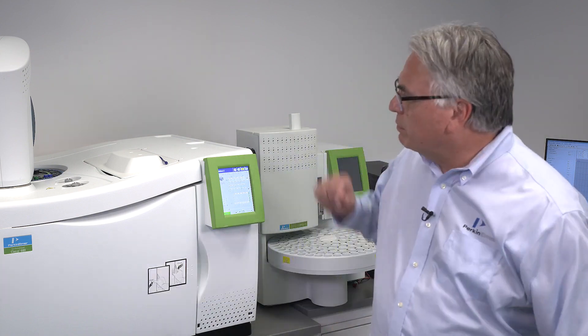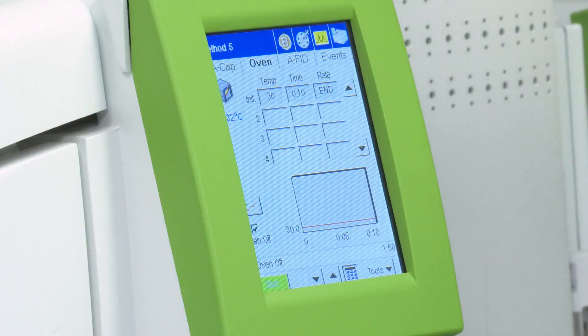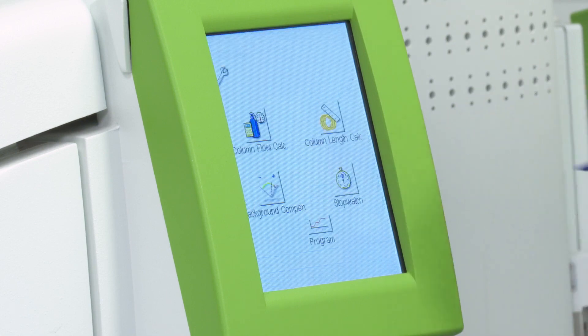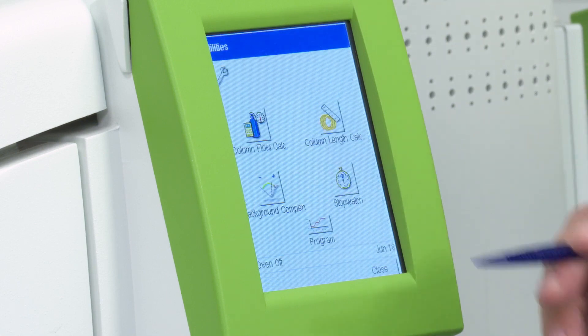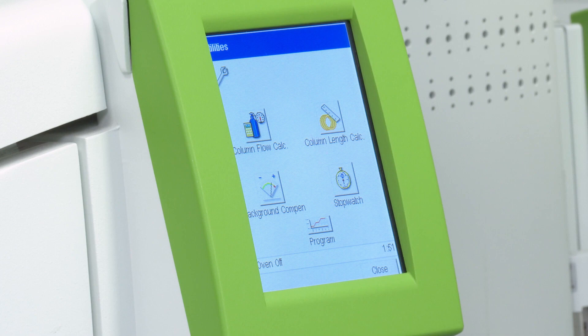The front panel interface of the GC has some useful utilities that you may want to access from time to time. Let's take a look at a few of them. So to get there, we go to Tools, Utilities, and you see we have some icons for the various utilities that are helpful.